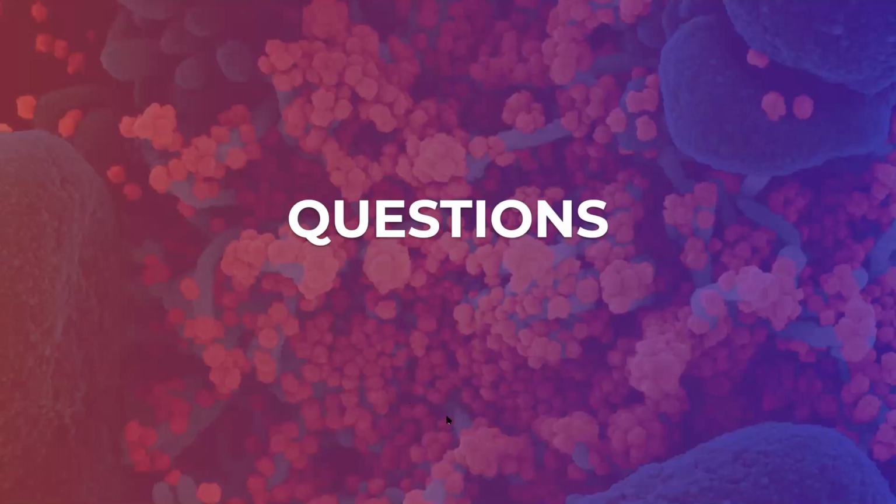Ilya, there are a few questions which I have. So we have one from Kehinde Adeshina. Please, what's the best sequencing platform for microbiome analysis? And do you have any guide on using nanopore sequencing platform for 16S rRNA sequencing? I would be working on this for my MSc research.